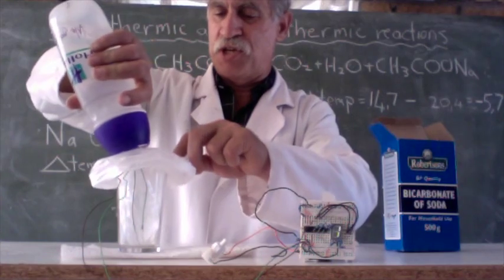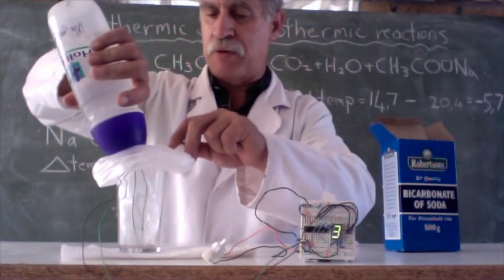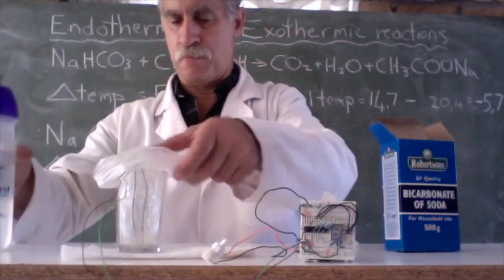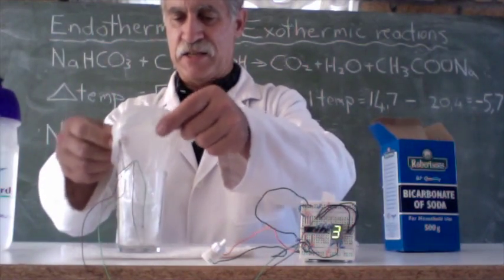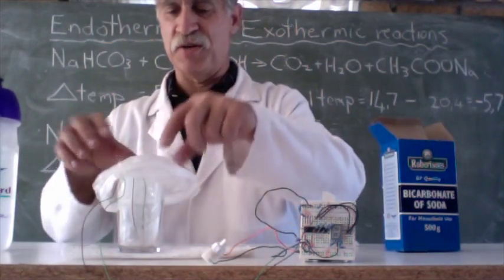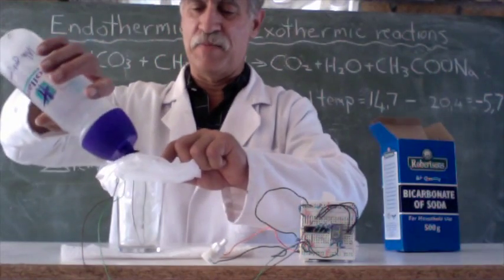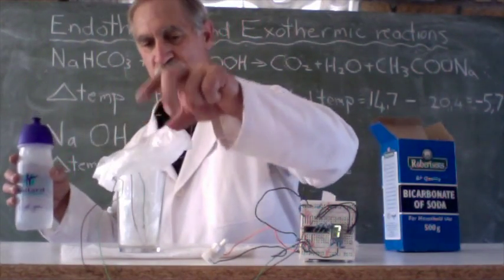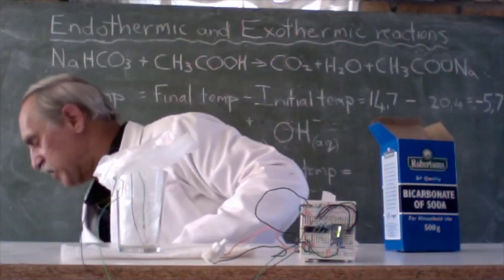So here's our water going into the bag. And let's get an initial temperature. Let the water settle down. So there is our little bag.